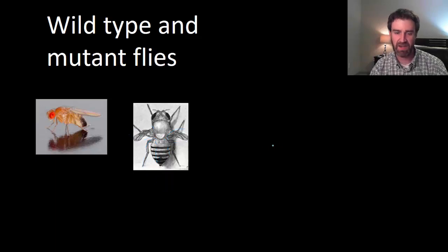Now you also have to be careful when you're looking at the flies, because sometimes when you're using your brush to move them around, you might damage the wings. So make sure that you can see that this is what the messed up wings genetically look like.